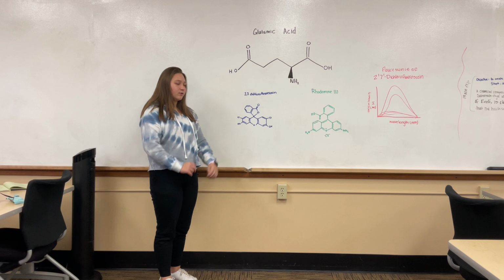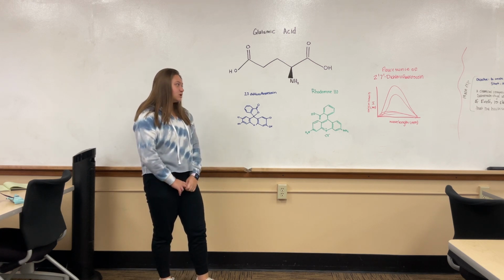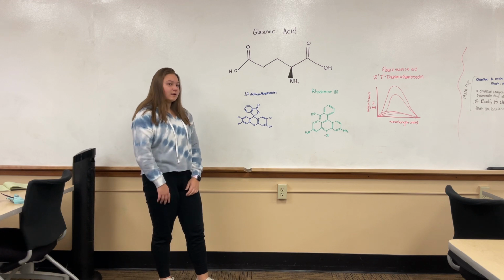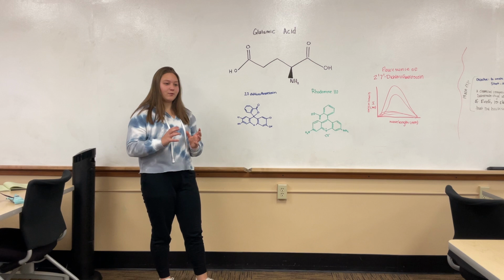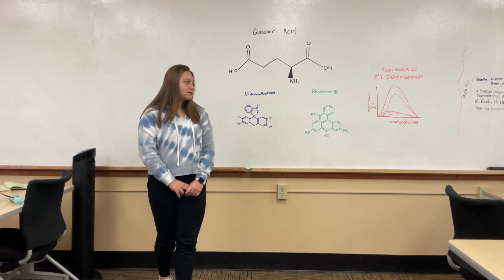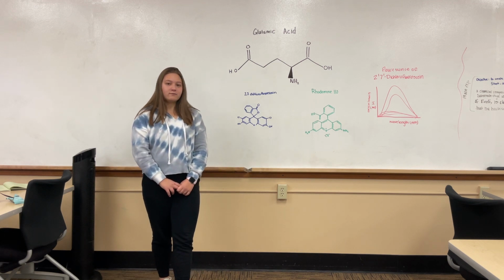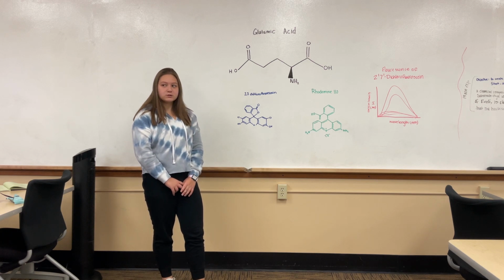We ended up trying both of these in one lab period and made a stock solution and diluted them. They're both super fluorescent, so they were a bright green color. And then we went to run the wavelength versus absorbance and wavelength versus fluorescence graphs.